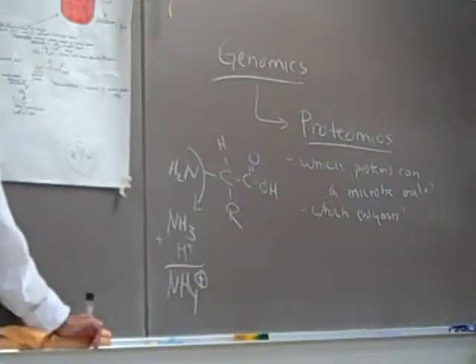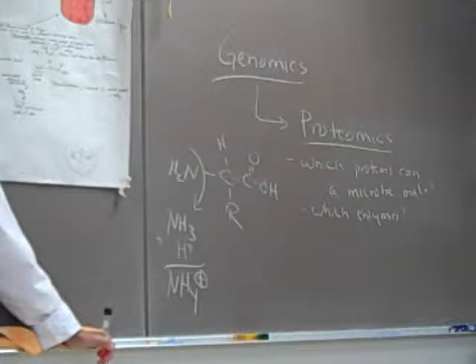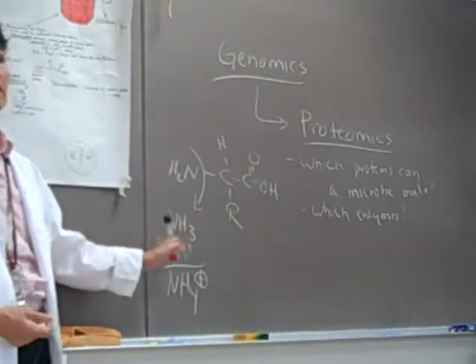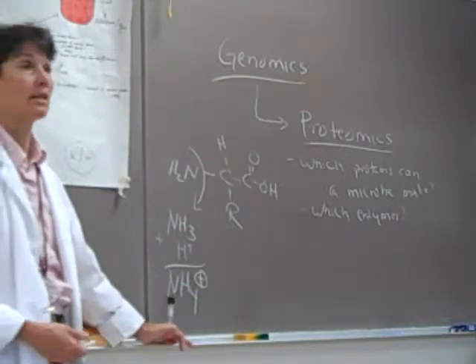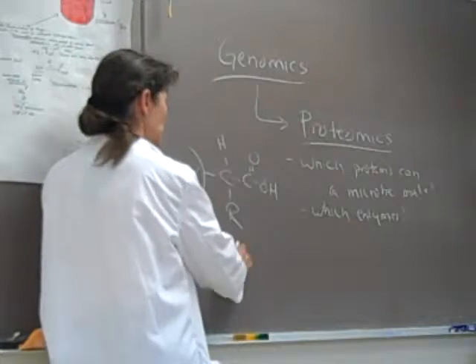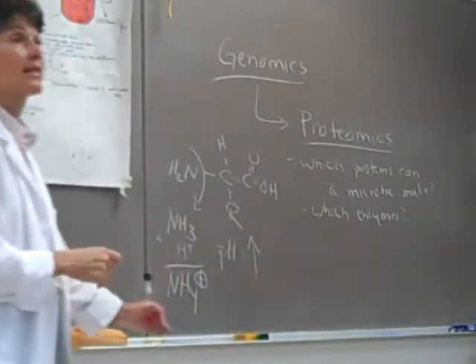Ammonium, right? Okay, so let's think about this then. If your microbes can't use the sugars, they have to use the amino acids instead, they release ammonia, which binds up free hydrogen ions. What's going to happen to the pH of your media? What's going to happen to the pH? It's going to go up, right? Okay, so that's going to be important.